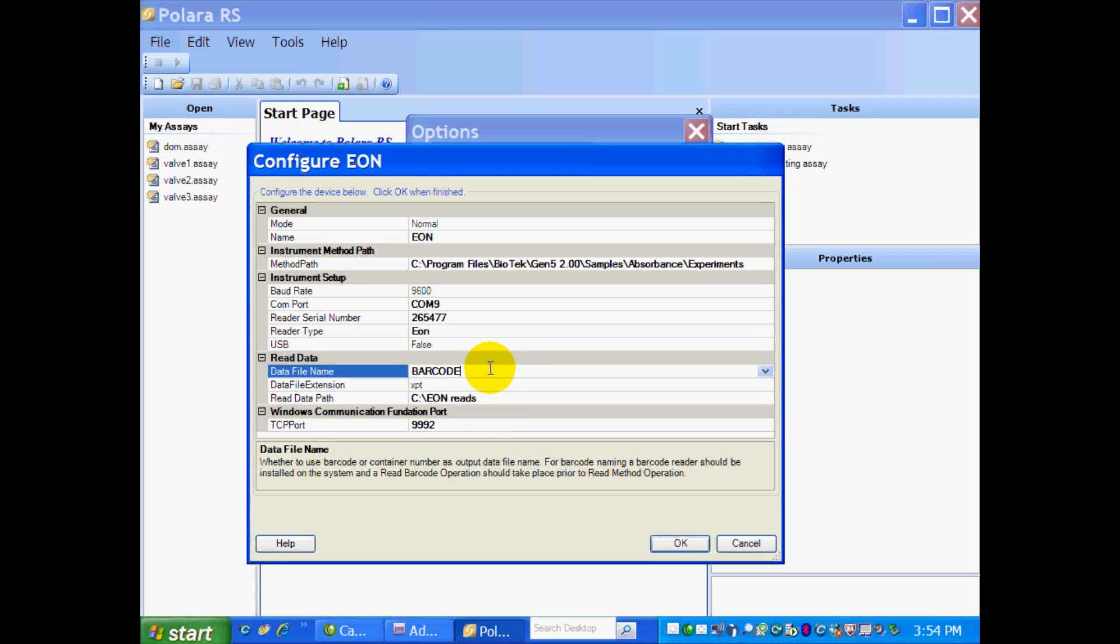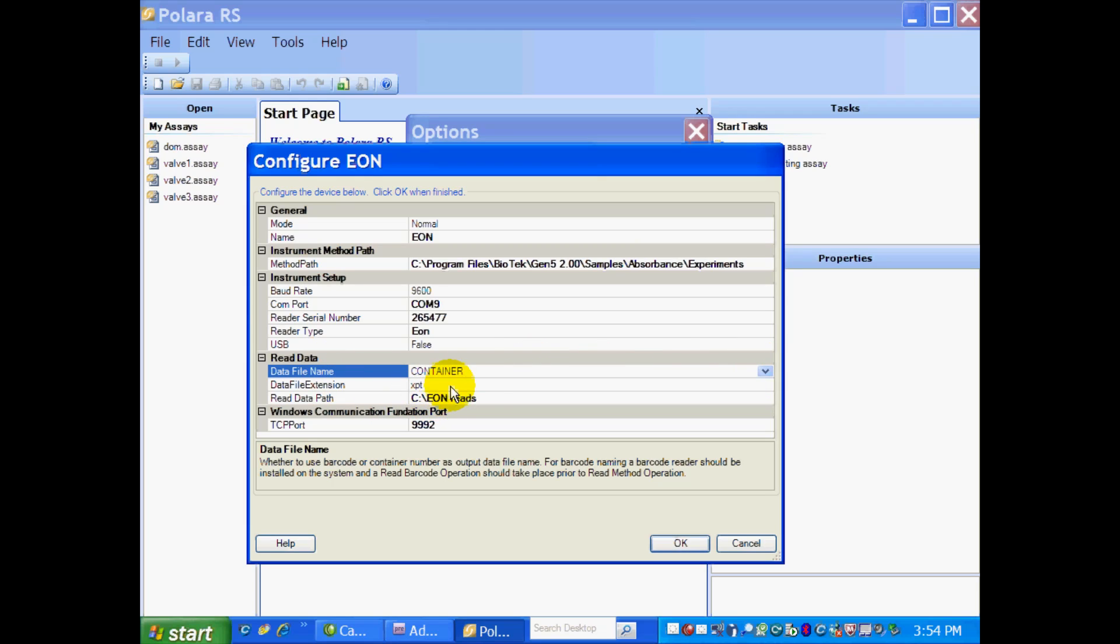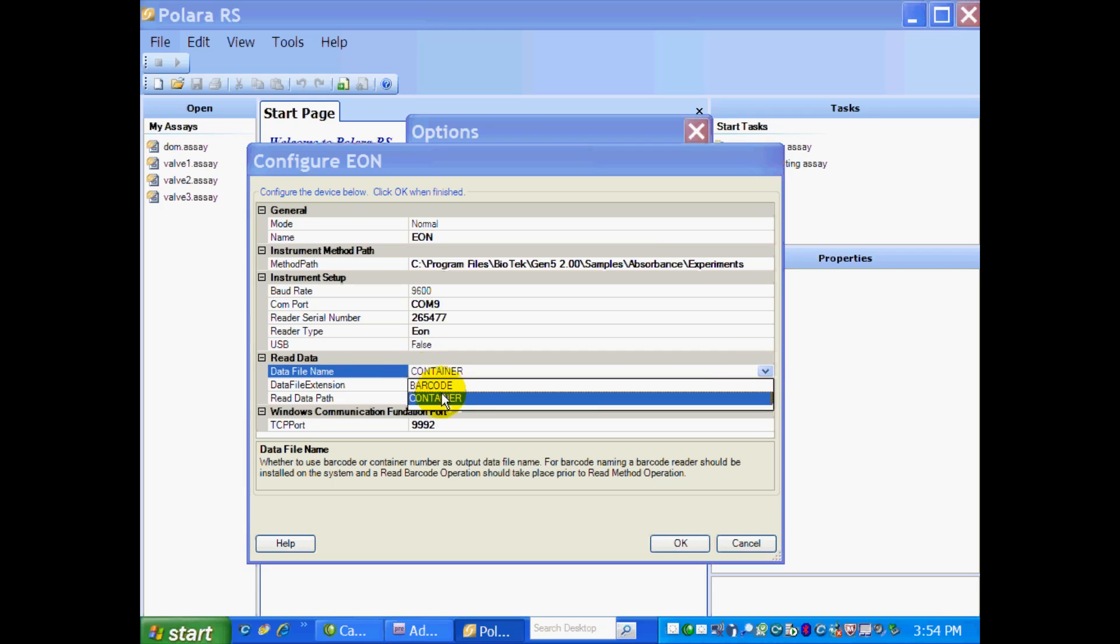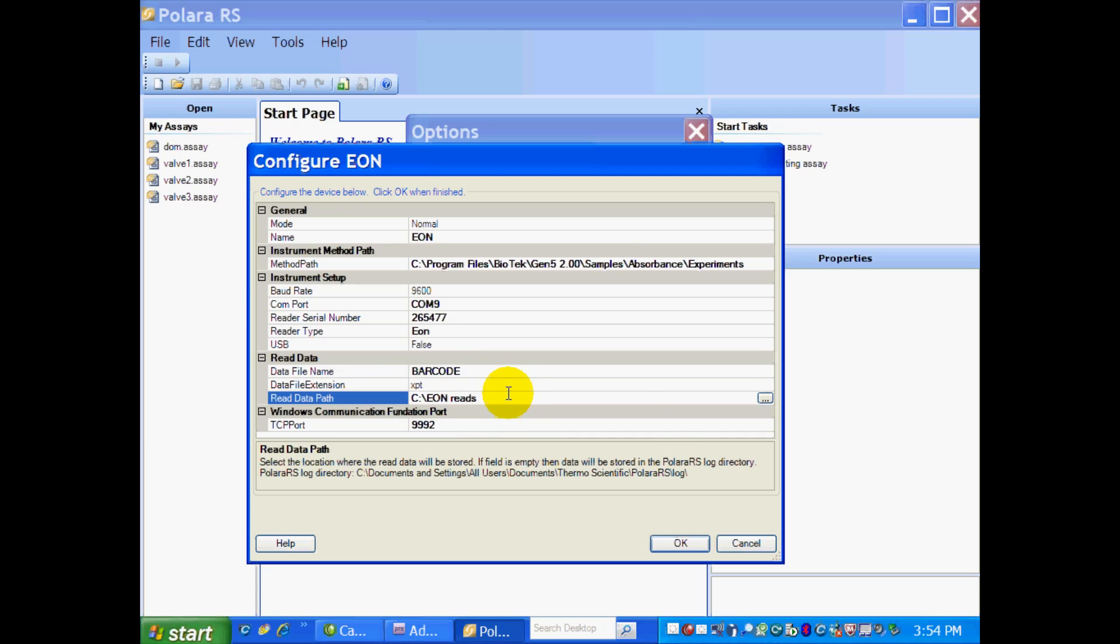On the data file name, I am going to add my barcodes. If you just wanted to add container names, that's fine. But I have a barcode reader, so I'm going to take advantage of that. And then again, you identify the path where you want the read data to go. So I just created a folder on my C drive called Eon Reads.